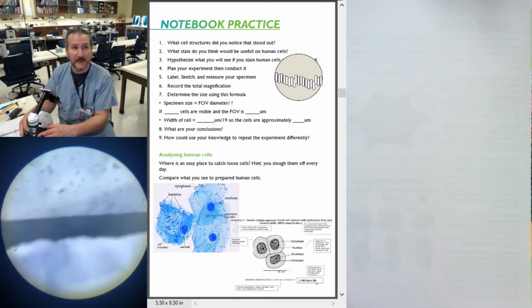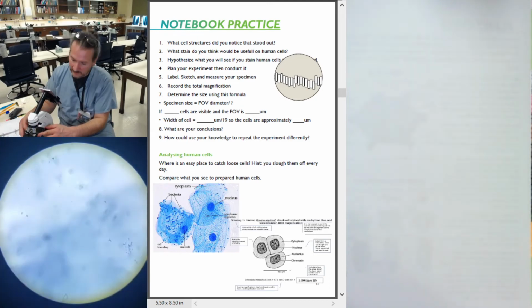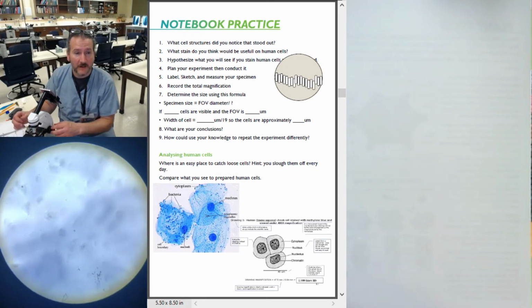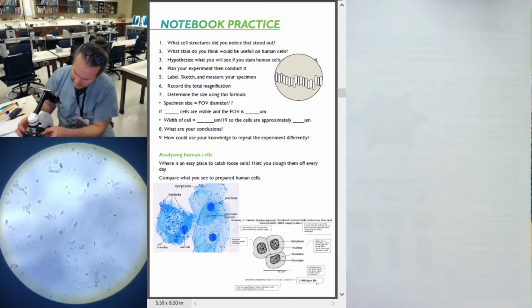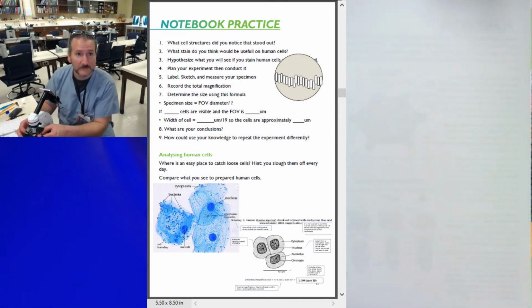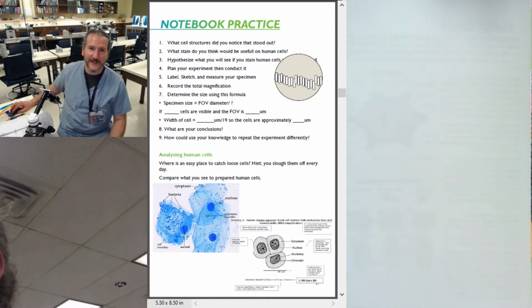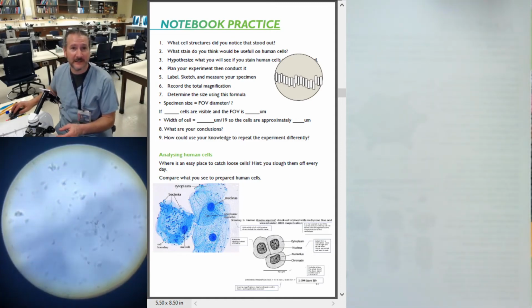There's my edge of my slide. Oop, lost my microscope. Boop. Boop. There's my face again. Don't want to see that. I see it every day. Get sick of it.